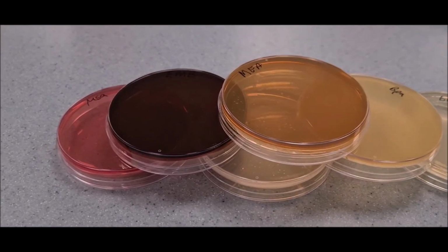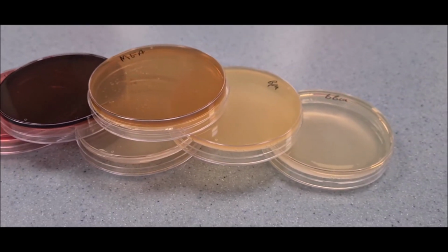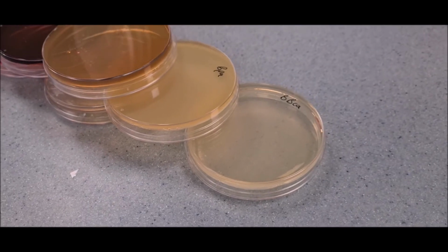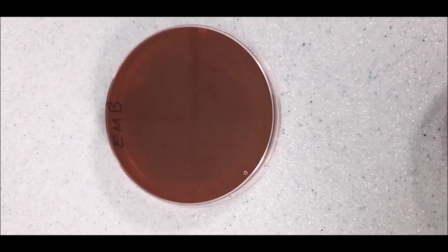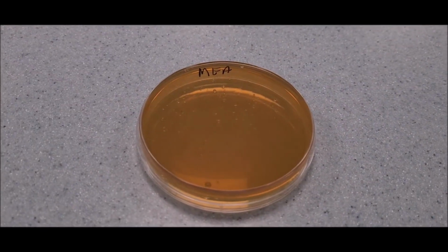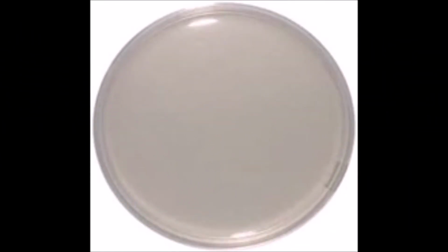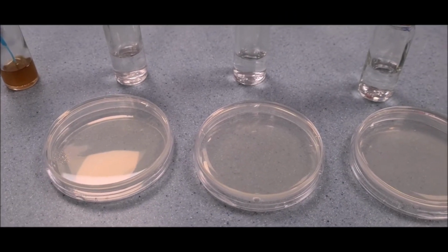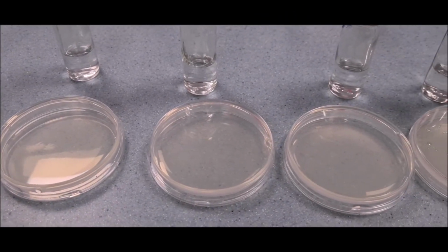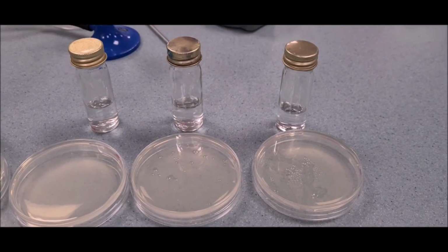In this demonstration, we will use the selective and differential media used in the Week 3 interactive video presentation. These include MacConkey broth, eosin methylene blue, Baird Parker agar, mannitol salt agar, rose Bengal chloramphenicol agar, malt extract agar, Brilliance Salmonella agar, Brilliance Bacillus cereus agar, Pseudomonas selective agar and chromogenic Listeria agar. We will use plate count agar for total viable count. Other names for total viable count are aerobic colony count, total plate count, and total aerobic colony count.